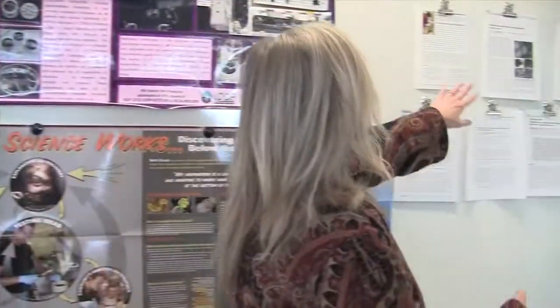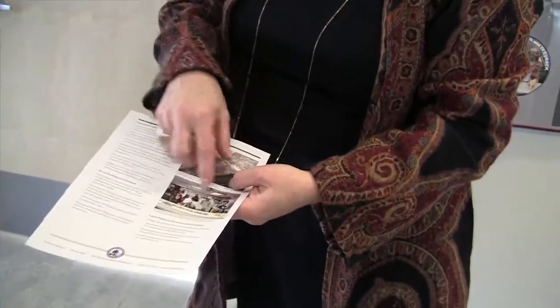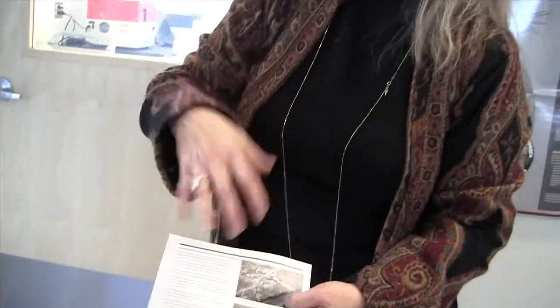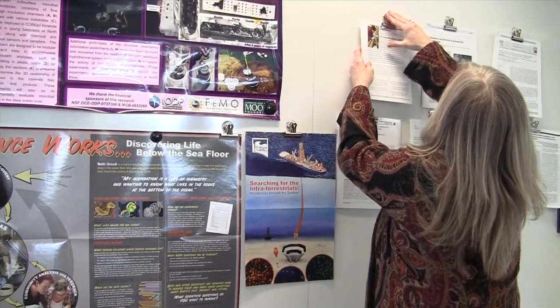And do they have to get their measurements on site, or can they get them by satellite? I think it's both right now. They're mostly able to go and get this. They want the physical samples. That's what these rocks are actually. Yeah, it's like moon rocks. They're actually looking at rocks that are down there, and they're bringing up a core on the ship and starting to see it there. So it's a new technique that hasn't been going on for that long, and we have one of the scientists that's in the forefront of this. So it's the Deep Biosphere Lab is what we call it here, and its potential again for energy, for a number of things is really tremendous.